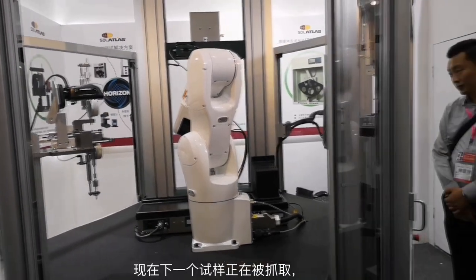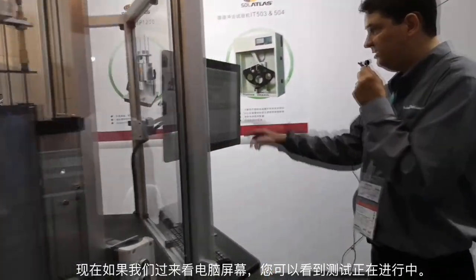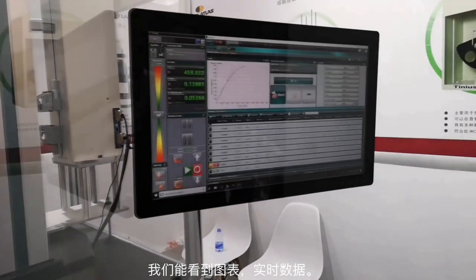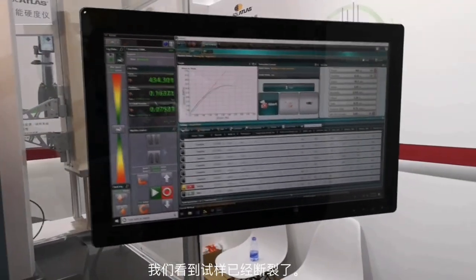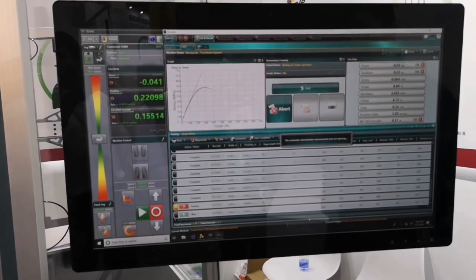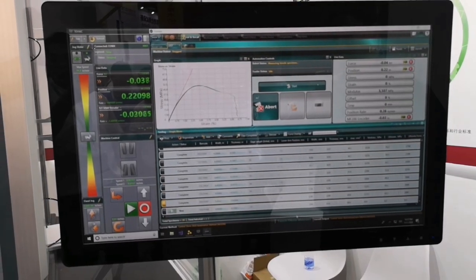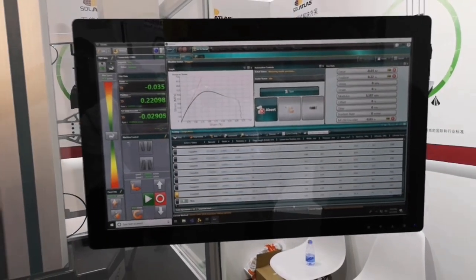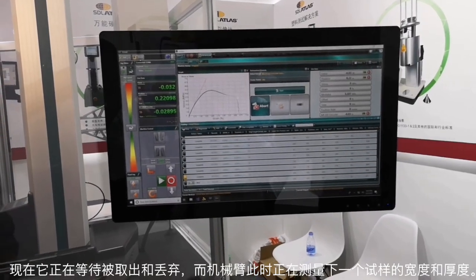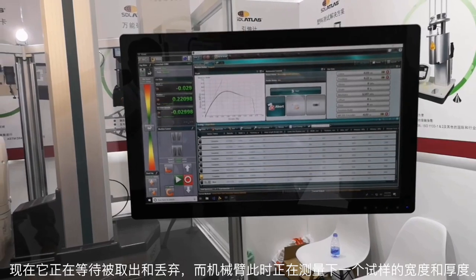The next specimen is being picked up. If we come over and look at the computer screen, you can see the test is in progress — we have the graph, the live data, and you can see the specimen has broken. It's currently waiting to be picked up and dumped, but it's measuring the next specimen for its width and thickness.